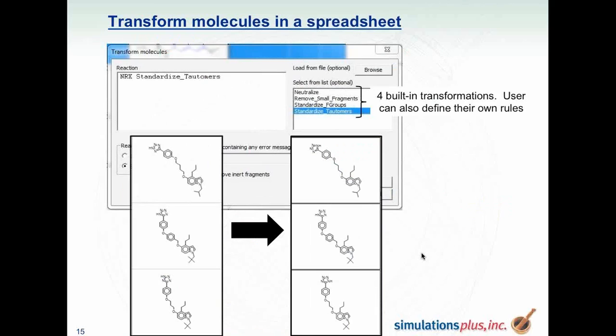This option will allow you to convert molecules from one form to another, for example, in the case of acids, you can convert the ionic form of an acid to the neutral form of the acid. So this option allows you to manage the way you draw the structures for the acids, if you want to see the structure of the acid in a large set of molecules. So that option is there.